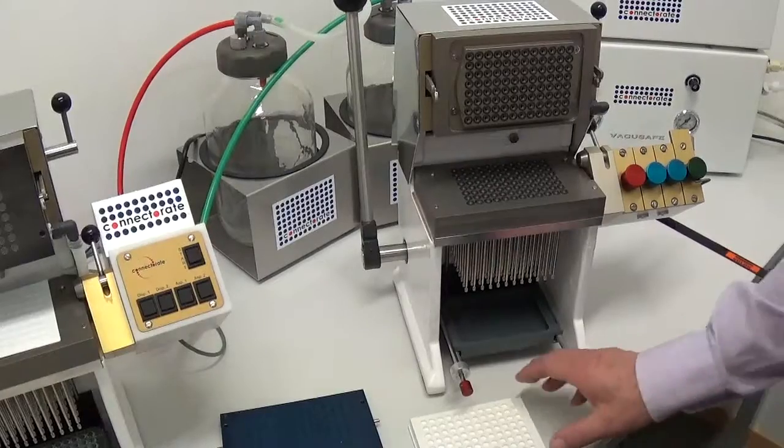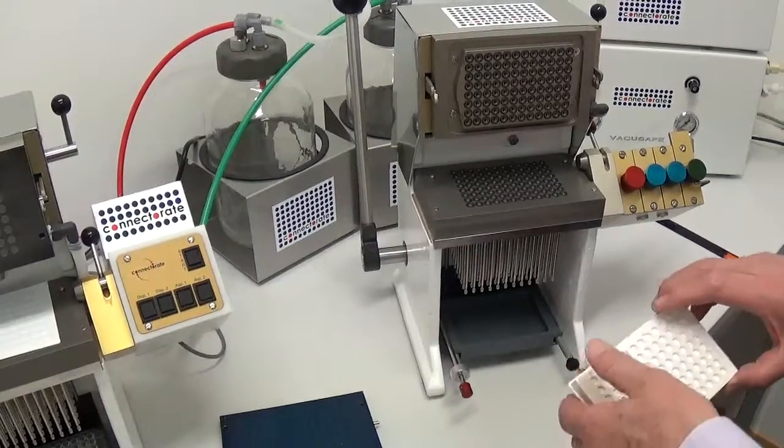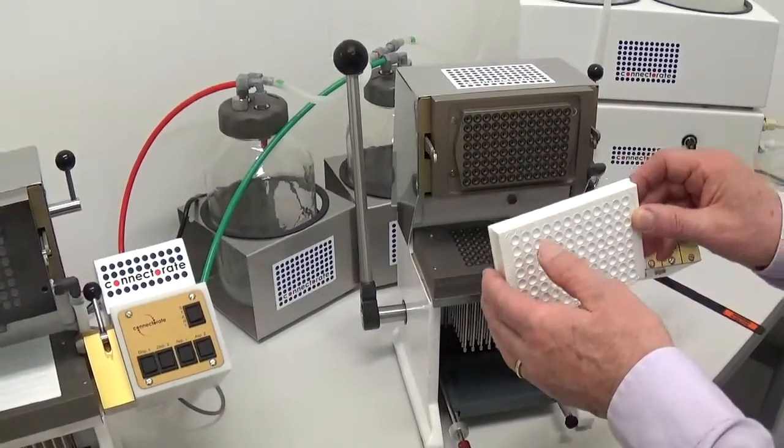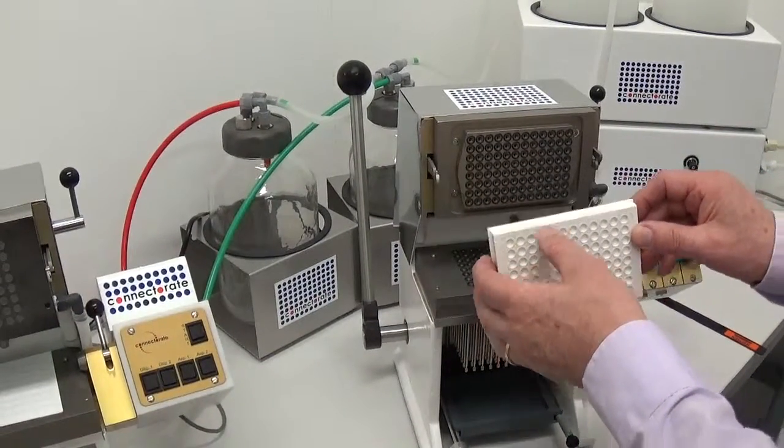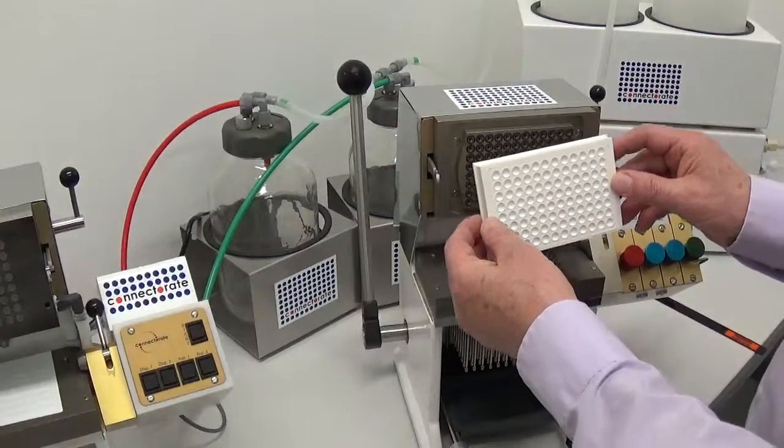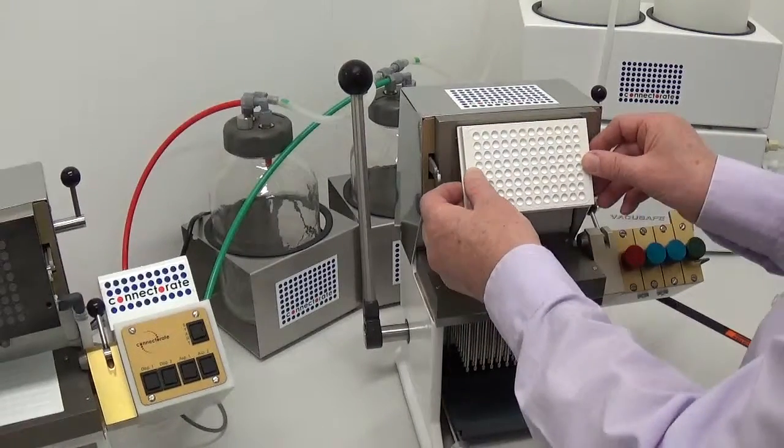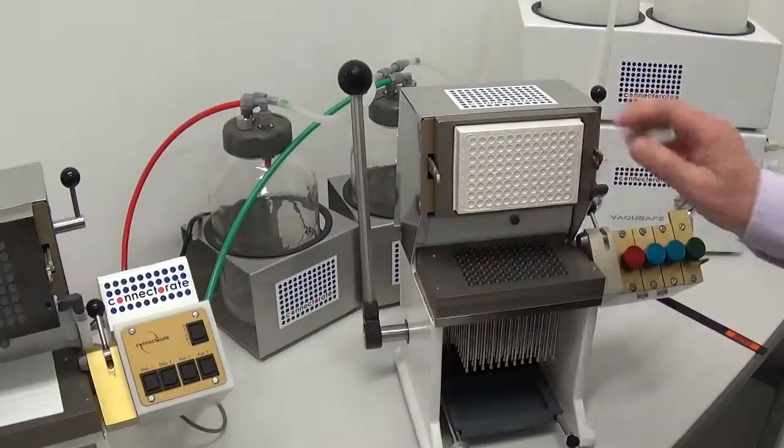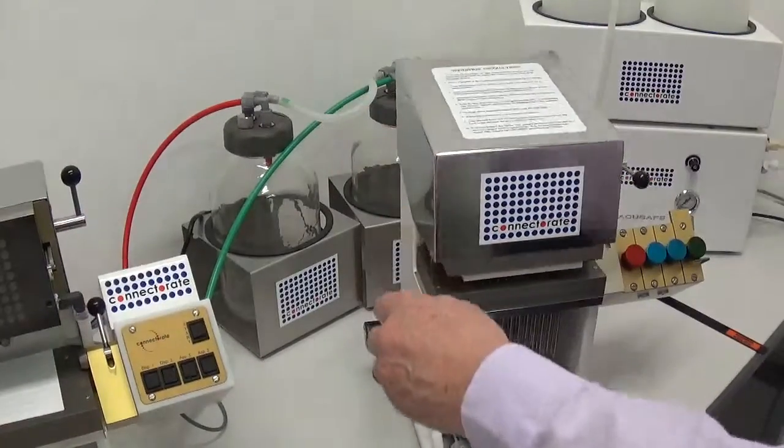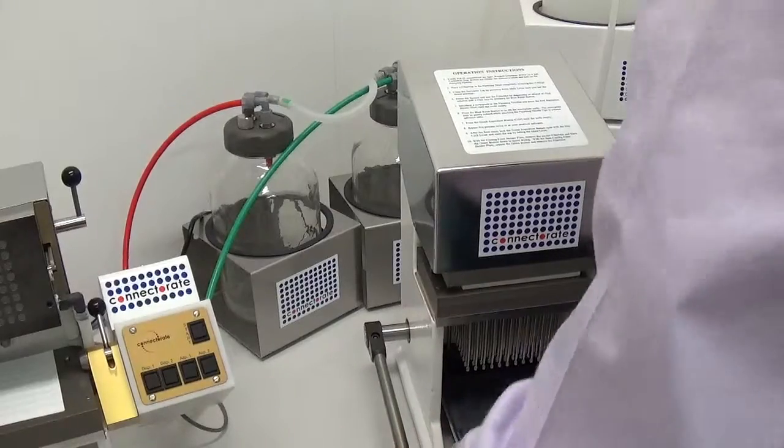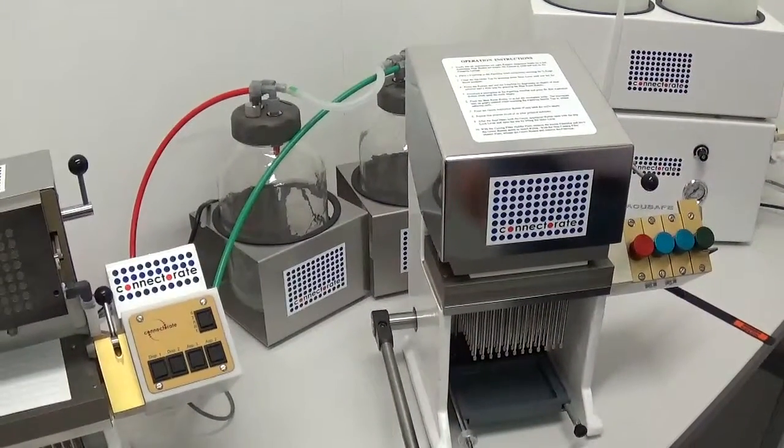Instead, the filter plate is firmly mounted in the upper protruding head of the harvester. Then close the harvester and you can start the operation.